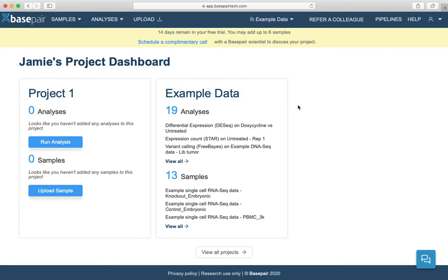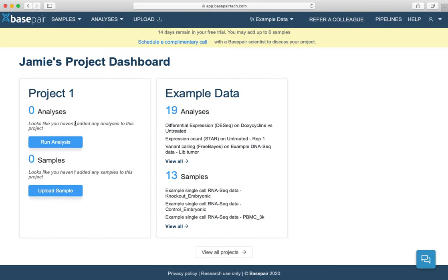Once your samples have uploaded, you can start running analyses on your data by clicking the analysis tab at the top, then new analysis, or by clicking this button directly in your project.